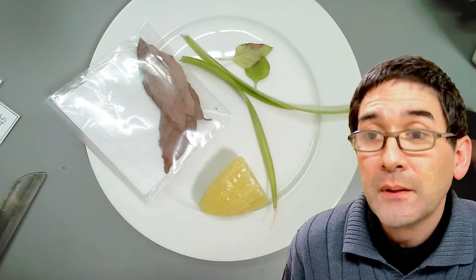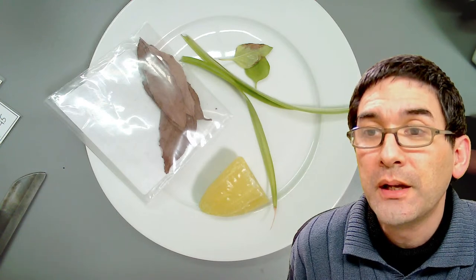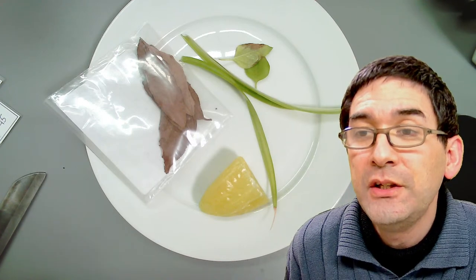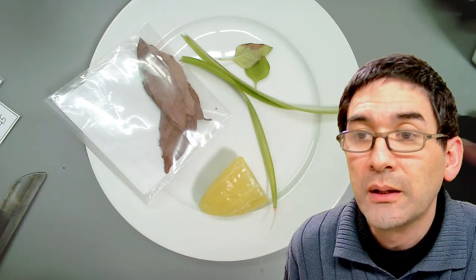Don't overfeed them — I've got a second one over here and they're doing fine. The first one from last week, I added a little bit too much food and it turned. So don't overfeed them — they're delicate. And is that an Olympus BX53? Yes, that's correct, that's my microscope. It's a little bit off topic, but can you someday make a video about culturing, for example, Stentor? I can try to do this as well.